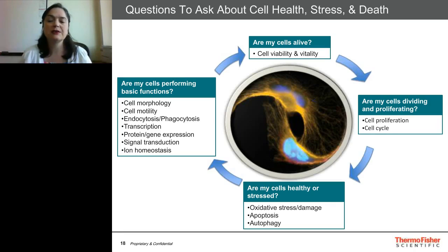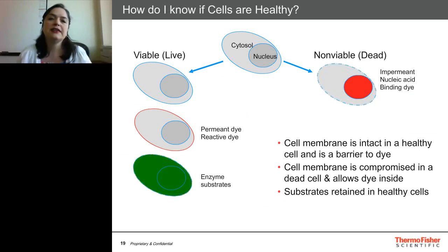And so something to understand is really, when we talk about fluorescent imaging, what we mean by a live cell and what we mean by a dead cell. So what makes a cell alive is a philosophical question, really, and it could be debated and has been.